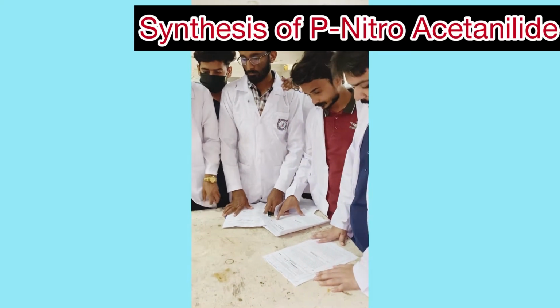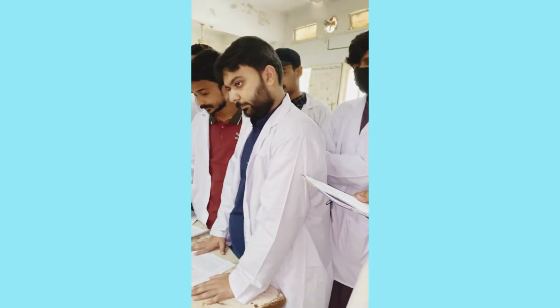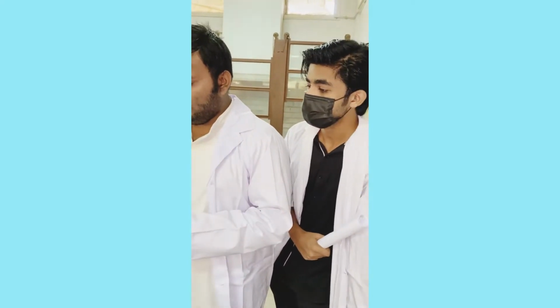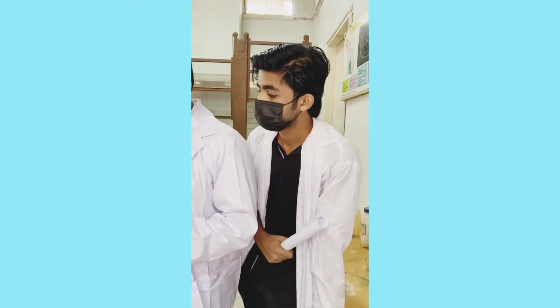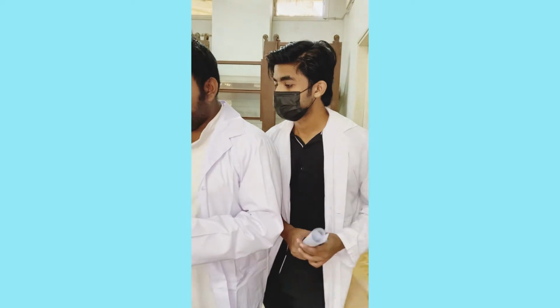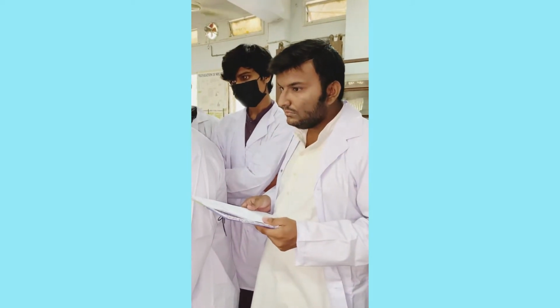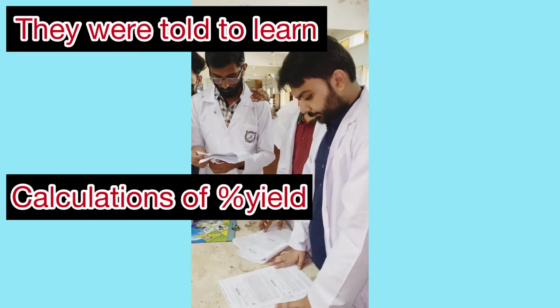You can use either term, because now you are going to prepare an organic compound, P.Nitro acetanilide from acetanilide, and calculate its percentage yield.